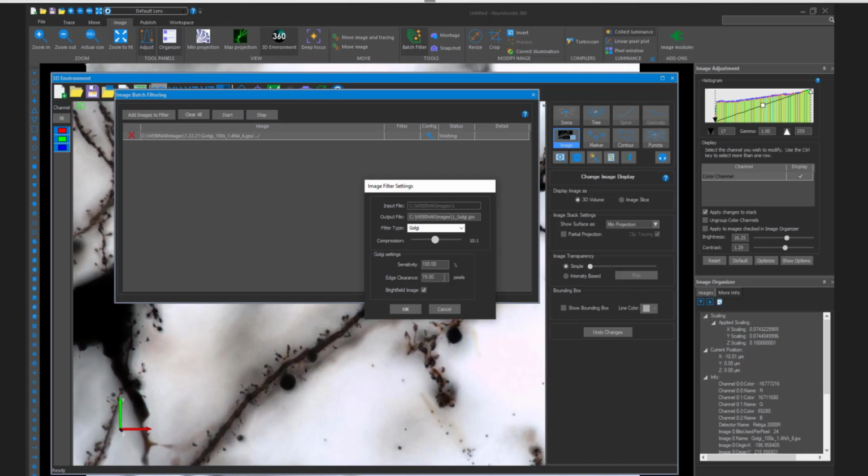If you see that there's still a lot of smear and a lot of the background presented next to your foreground and next to the branches that you want to reconstruct, you can always diminish this value and tighten up what the edge clearance is going to be affecting. To start, it's always recommended to use the default settings. There is no exact answer because images vary, so it's recommended to start with the default value.